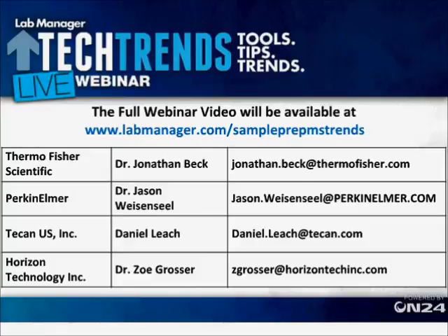This is Jonathan. I can answer that. We do have some, and I'm sure the other vendors as well have some, spreadsheet-type calculators where you can take the cost of your various inputs, things like how much your labor cost is, how much you're paying for solvent, the number of samples you're running, and time. And it can give you a report back on how much time it would take in your laboratory to recoup the additional investment cost of the automated techniques.